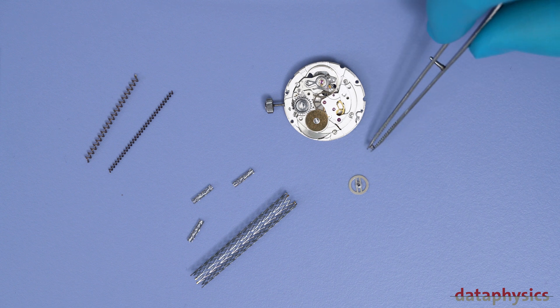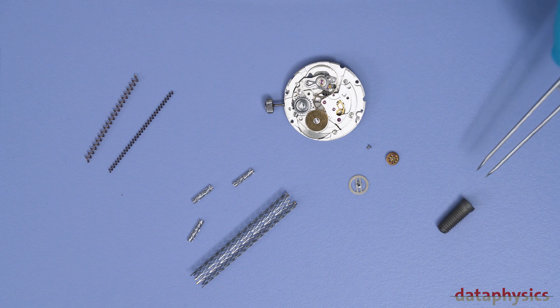These insights can help improve, for example, biocompatibility or in the design of superior lubrication oils.